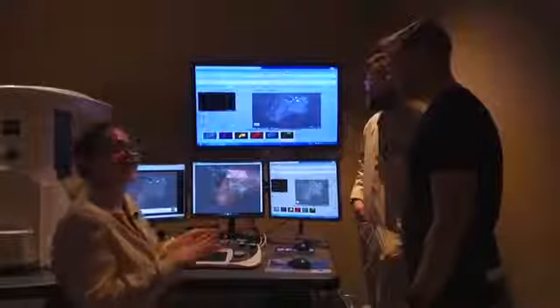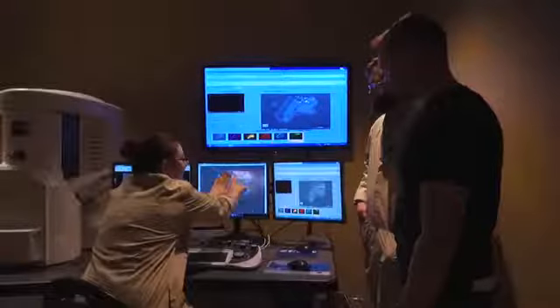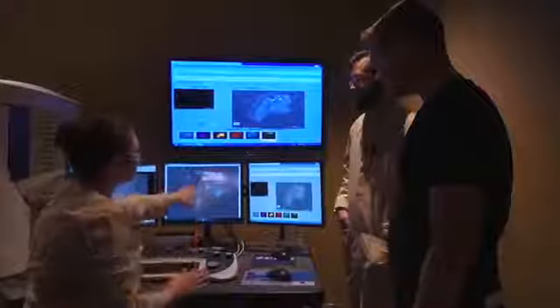We're looking at some images of that tiny flake of paint that Glynis took from the surface of the artwork. So if you imagine that the painting is sort of like a cake or the Earth's crust, then what we're seeing here is the top layer, like the frosting, and then that red glaze layer, and then we have this pink layer, and then below it, this sort of translucent area is the gesso, so that would have been the ground layer.